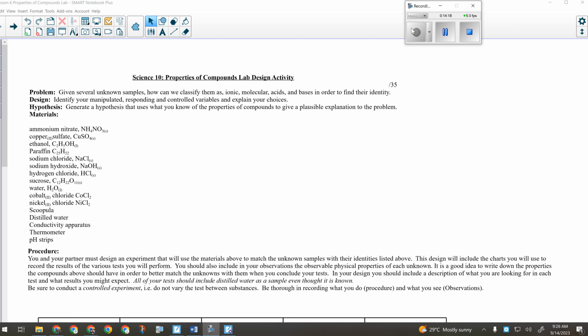In this experiment, several unknown compounds are going to be subjected to various tests to reveal their physical properties. I don't have to say necessarily which tests. It's not bad for me to say observable properties, solubility, pH, aqueous conductivity. I mean, after all, I'm really only testing a few things. It might not be bad to name drop them slightly in the and part. But that's what the and part's role is: briefly describe what you're doing.